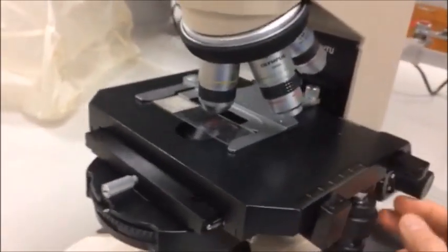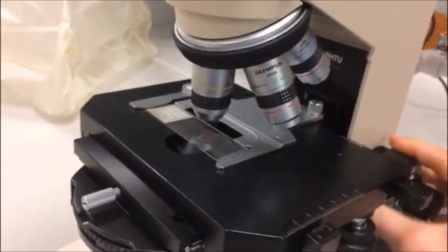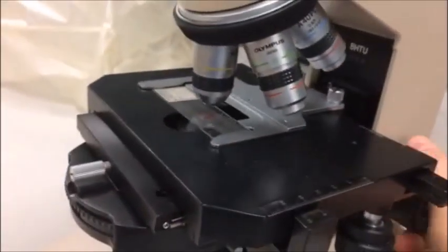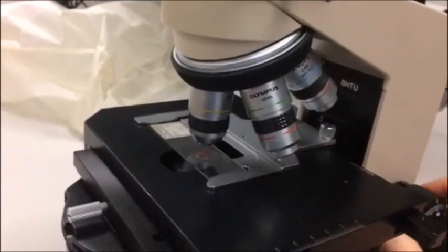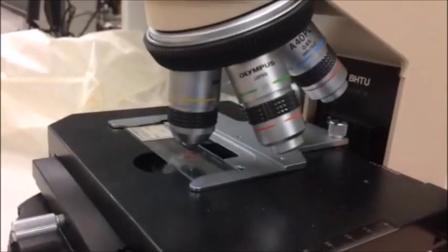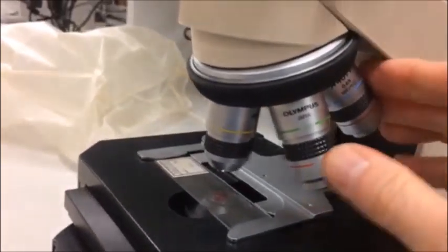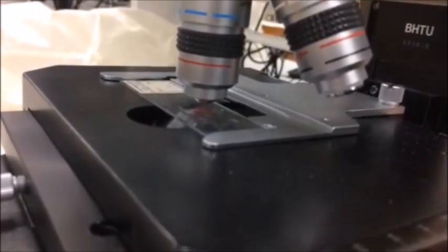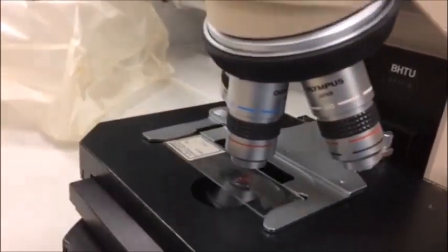The stage of the microscope actually moves up and down when you focus. So when I turn this focusing knob here, the stage moves up and down and the lenses actually are stationary. So one of the things you have to be careful about, not so much on low power but on higher power, is that if you crank the stage up too much, you can actually crash the slide into the objective lens. So that's something you want to be careful about.